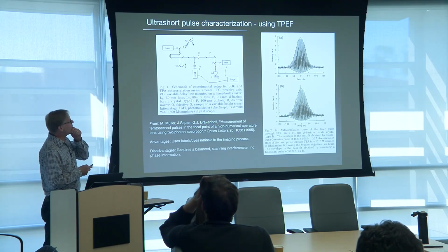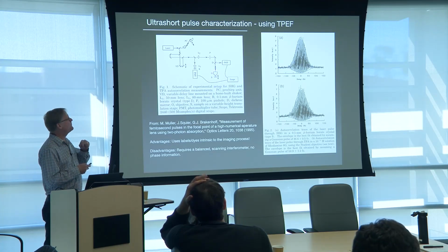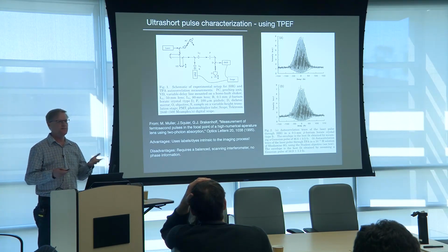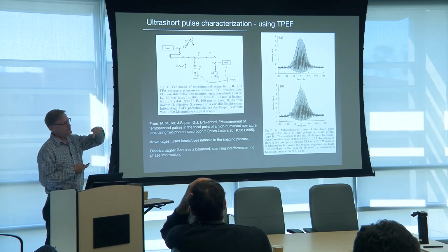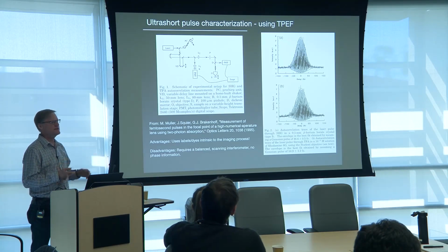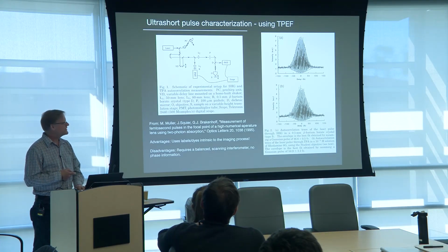So, and then what we found really quickly is this 8-to-1 was a really telling point for us if we had spatial aberrations. So if we fill the back of the objective, that 8-to-1 would in general go away. And it was really due to the radially varying group delay that might be present in the objective. So in general, we're always using just a thin ray that goes down the center of the system and then scanning it around to take a look at things. Because otherwise, this starts to deviate. So you can really use these right away to measure other aspects about how well your system's performing. So take a look at the noise from that.